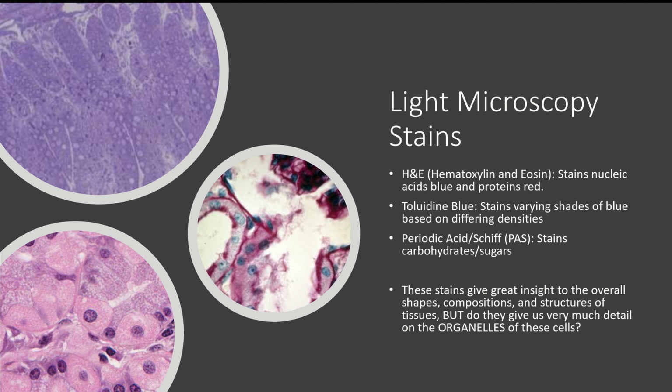What stain we're using and what that stain is used for, so what that stain actually deposits its color for, okay? So it helps you to know that the more red things in an H&E stain are going to be the more protein rich areas, okay?